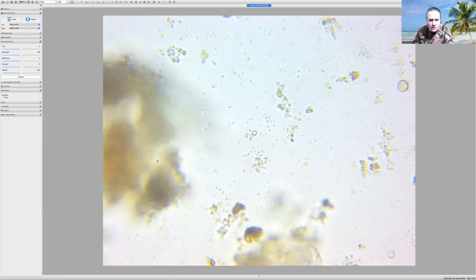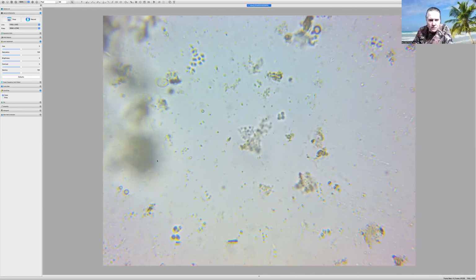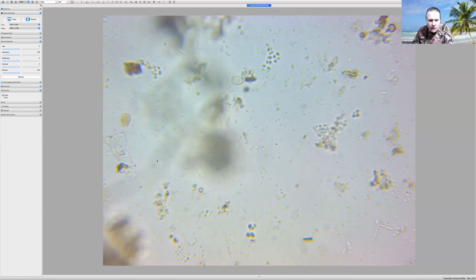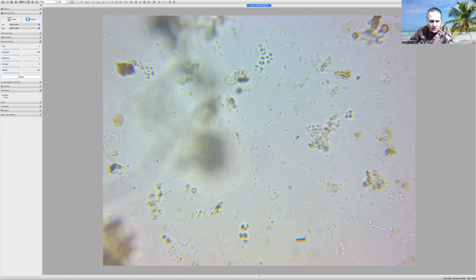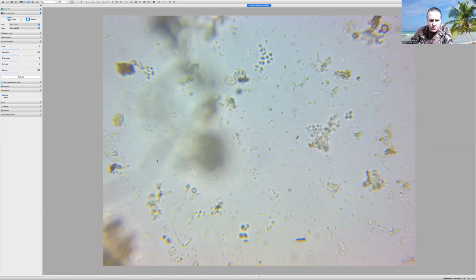See flagellates coming through here. Super numbers of flagellates. What I can do to speed this. So like this right here, these look like almost could be a streptococci.